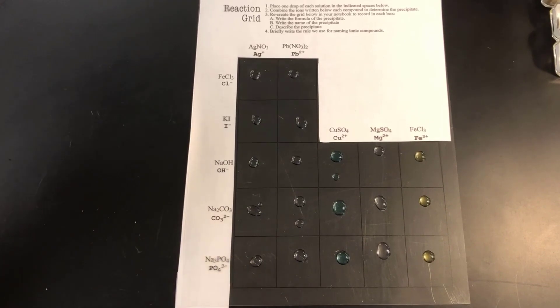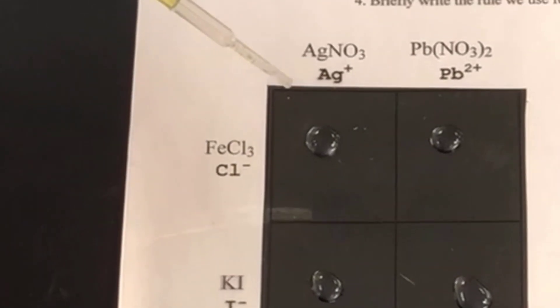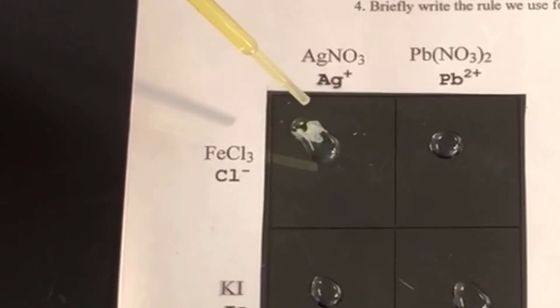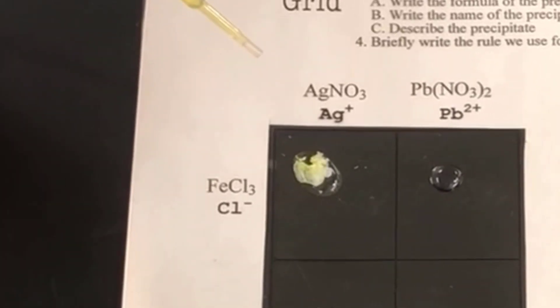Now we're going back to the FeCl3 because now we're going across. Before we were going vertically, now we're going horizontally. And FeCl3 is the first one at the top. Observe what happens.